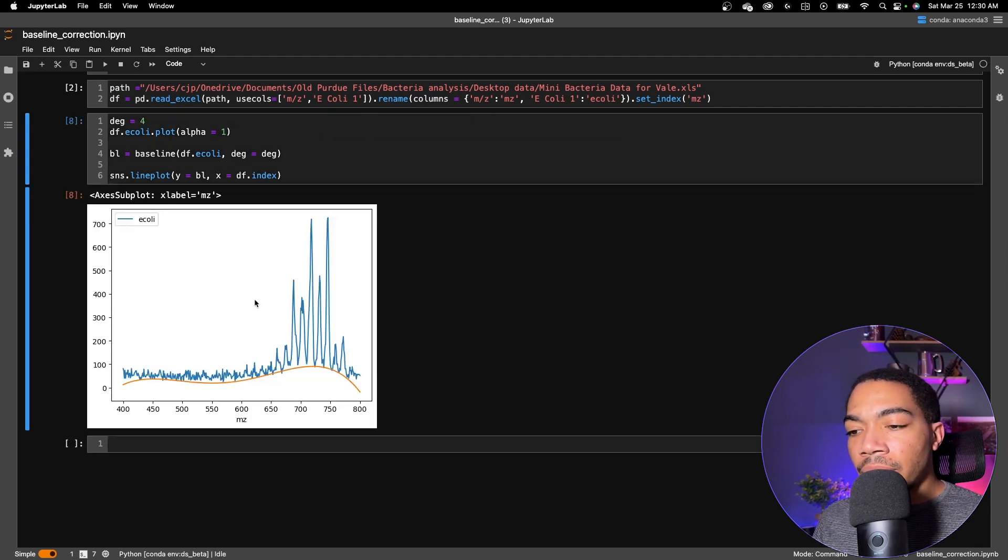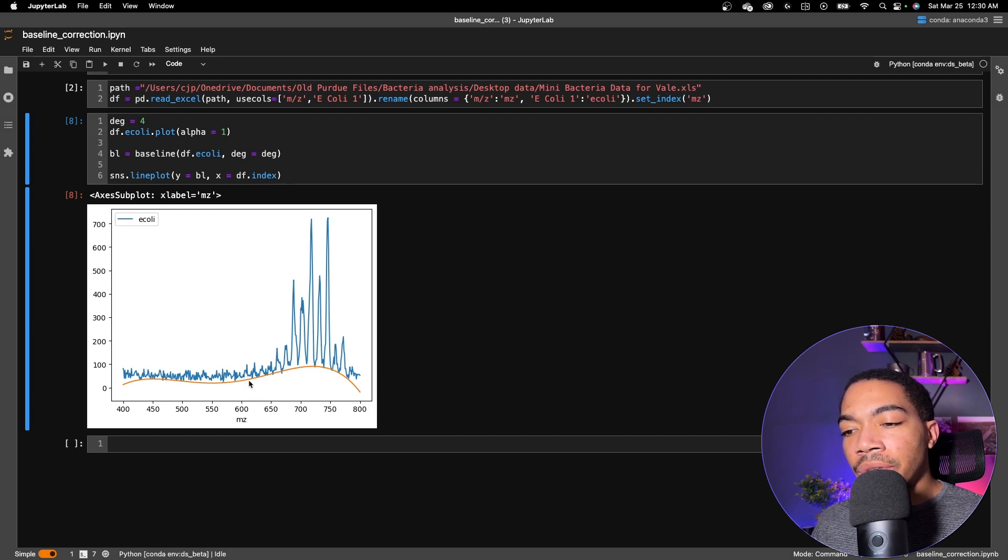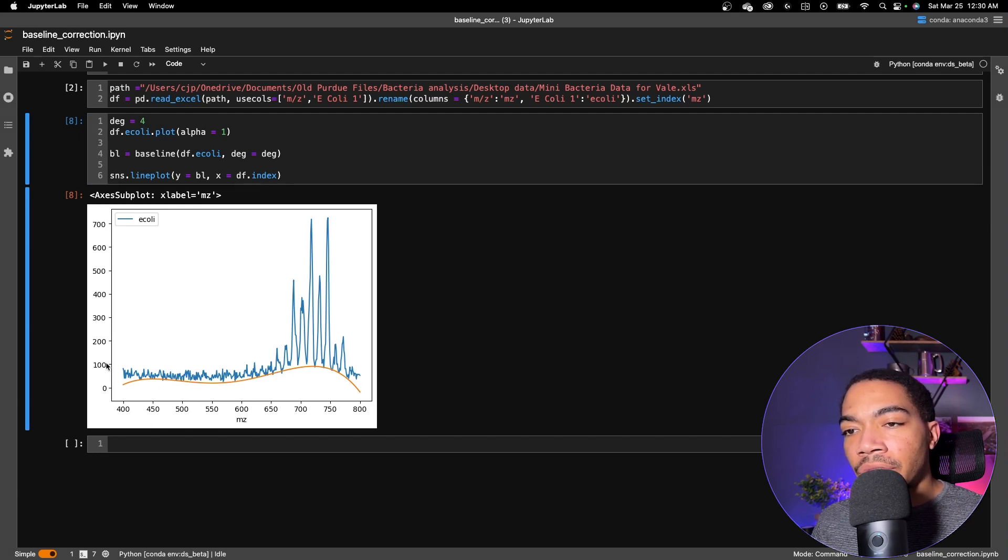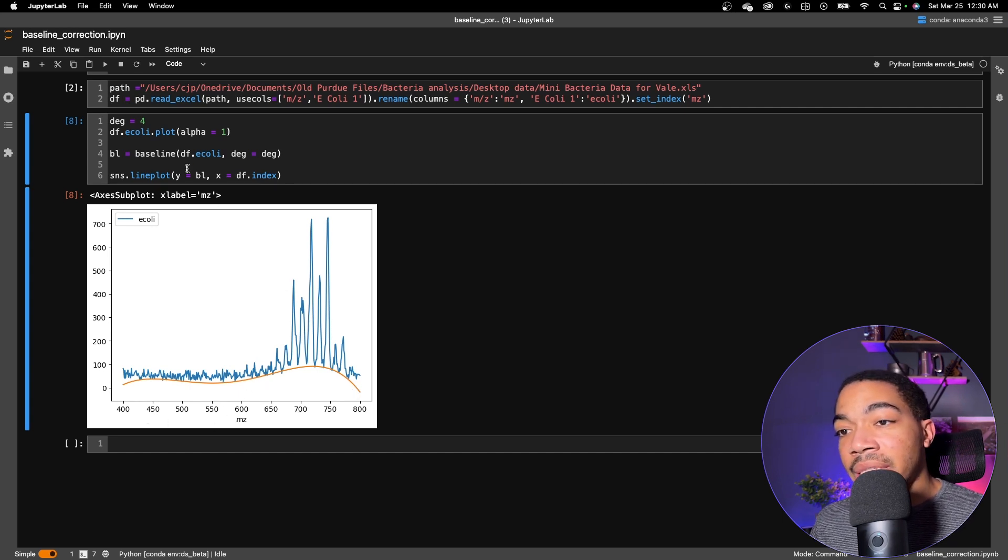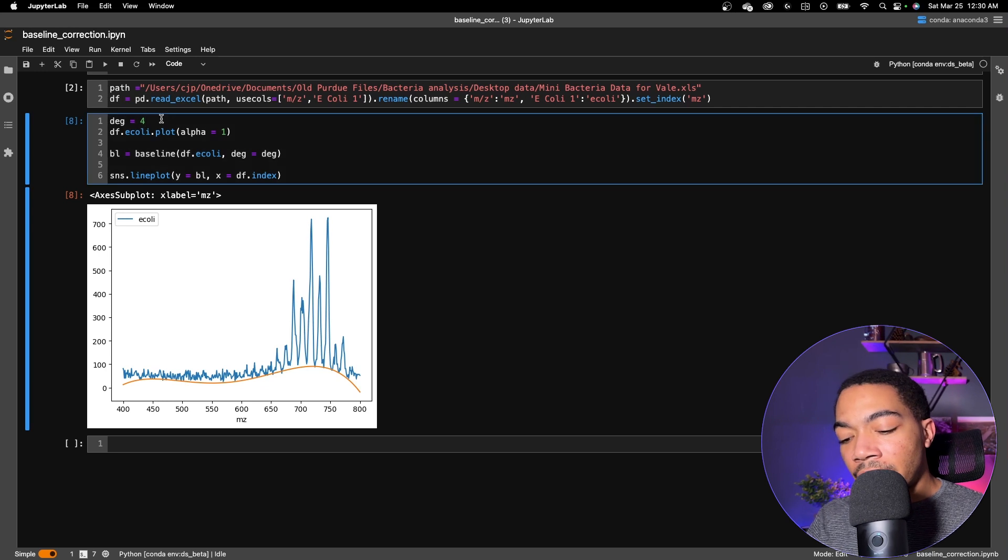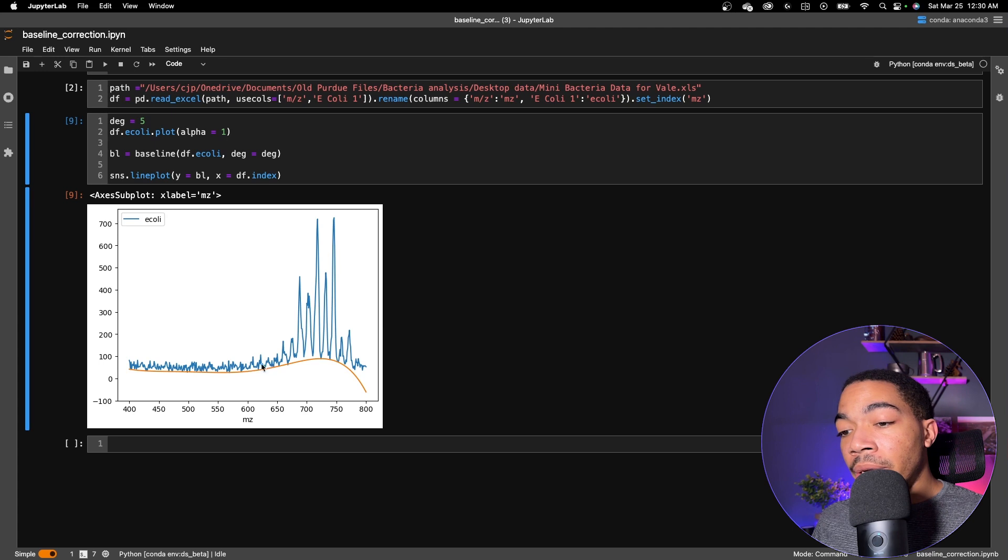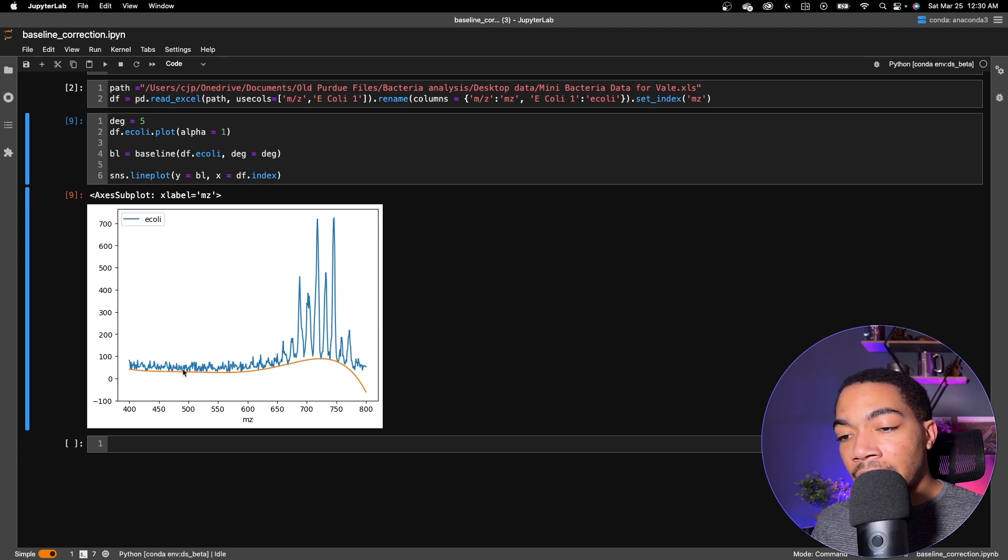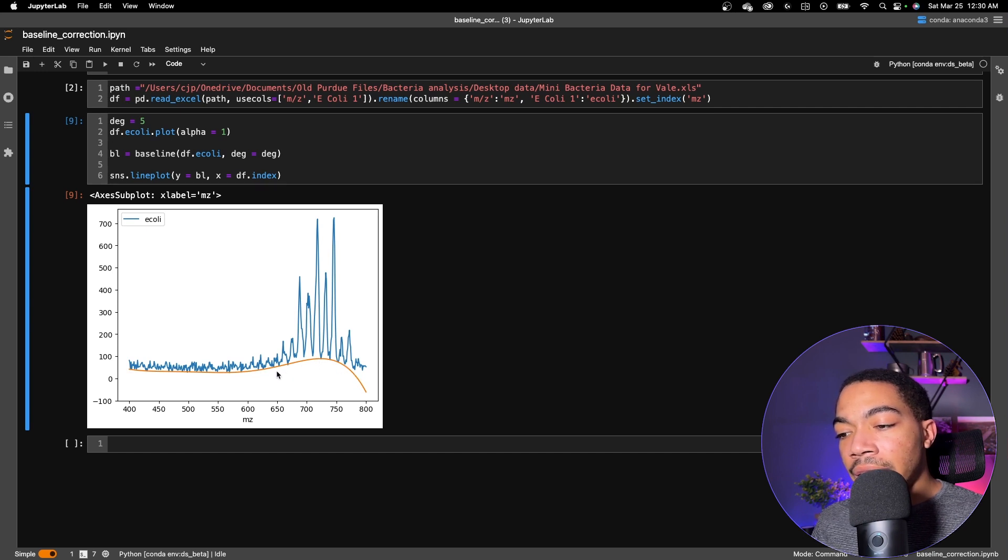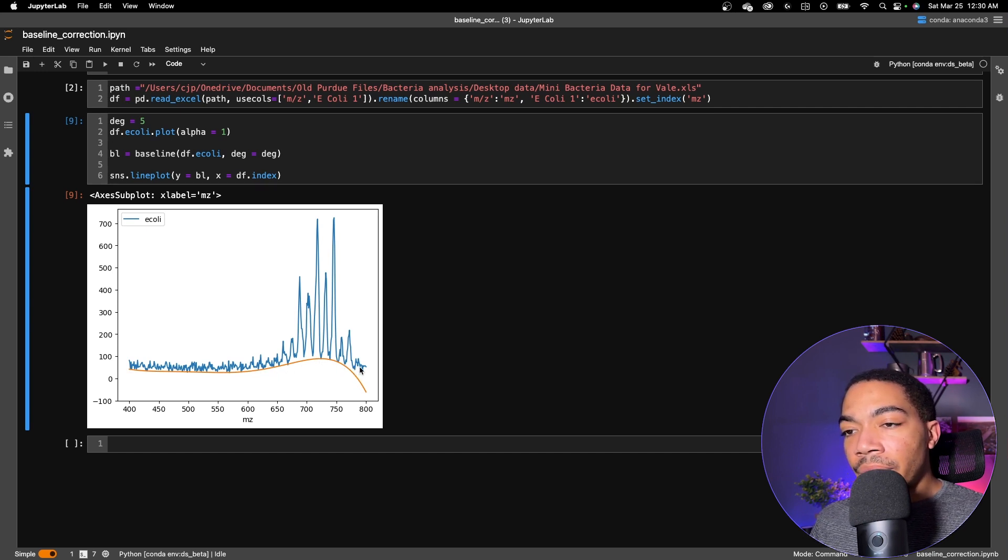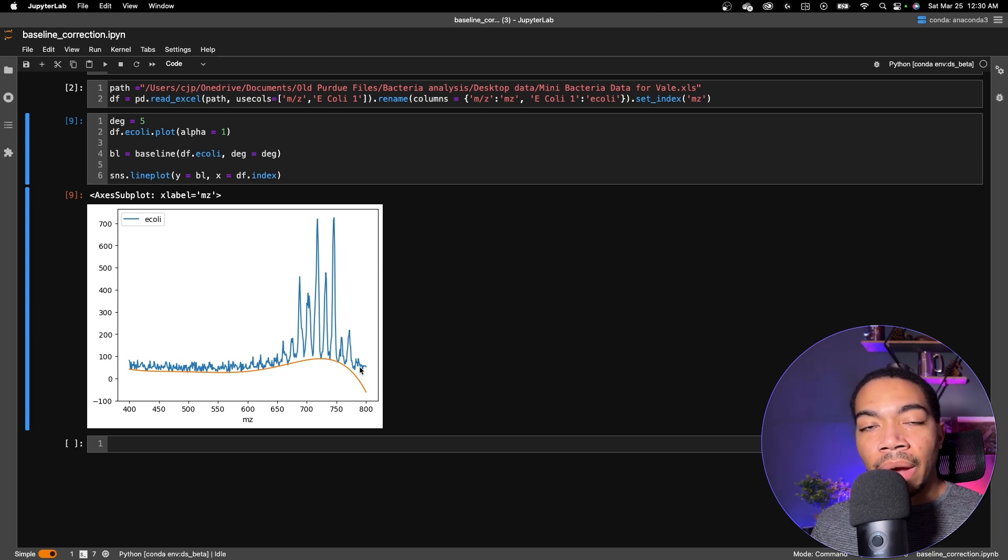Okay, so with a higher degree polynomial, we're doing a much better job of fitting this region and not introducing too many artifacts as a function of this higher order polynomial. And so I would say this is probably a pretty good place to stop. But let's see what happens if you go a little bit higher. So with a higher order polynomial, we do a much better job of getting a flat baseline between 400 to 600 and capturing some of this curve in the 650 to 800 range.